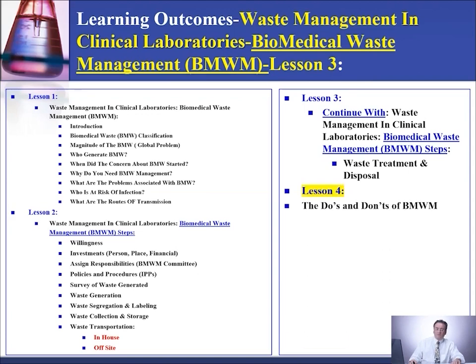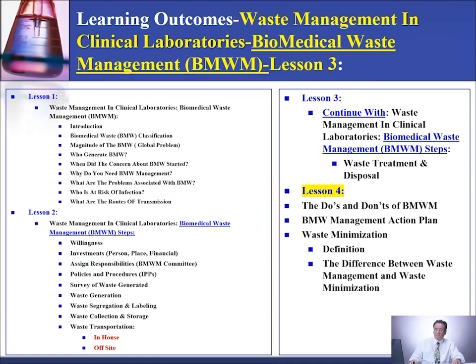In the last lesson, lesson number 4 about biomedical waste management, we'll talk about the do's and the don'ts of BMW. Then we'll talk about the BMW Management Action Plan. I showed an example of it. Then waste minimization. I'll give you a definition for that, and then the difference between waste minimization and waste management, why you should minimize waste, how to minimize waste, the 3 R's of waste reduction, and a subject summary. So let's start with lesson 4.